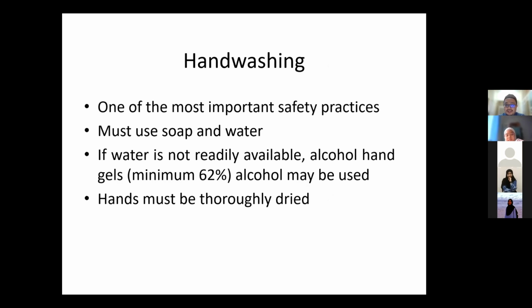Okay, let us look at hand washing. One of the most important safety practices. It is protective against chemicals, protective against irritants, as well as infectious diseases. Hand washing is actually best done using soap and water. Hand sanitizer is actually not the best. Many reasons.